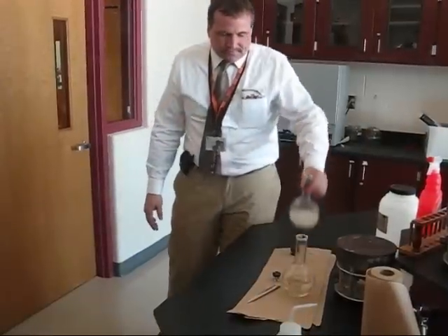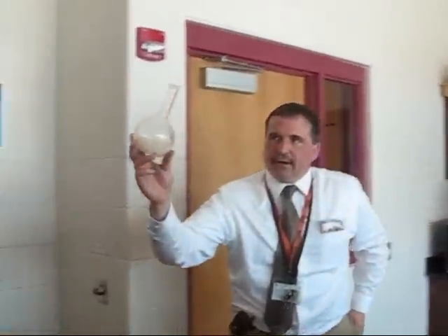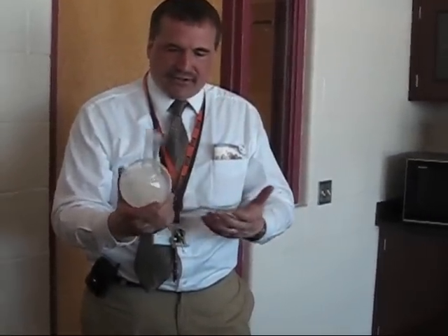Hours ago, both of these flasks looked like this. And this is, believe it or not, a saturated solution — but it's got so much stuff in it that it actually appears to be just a solid mass, though there's a very small amount of solution in there.